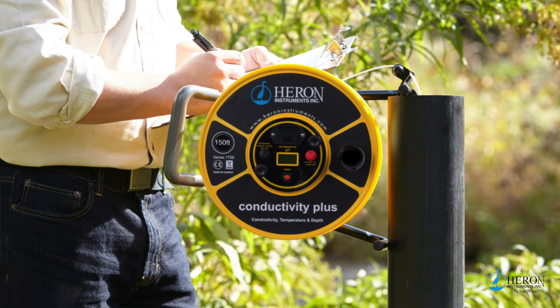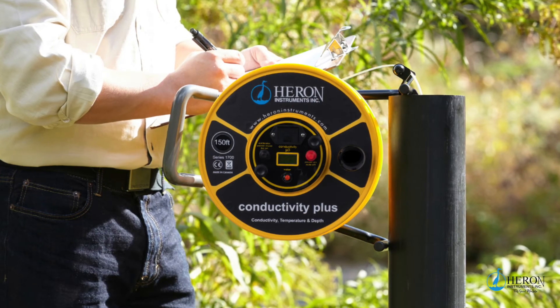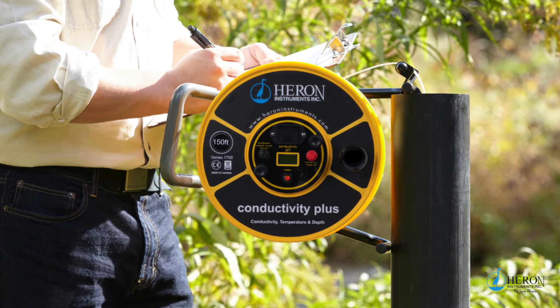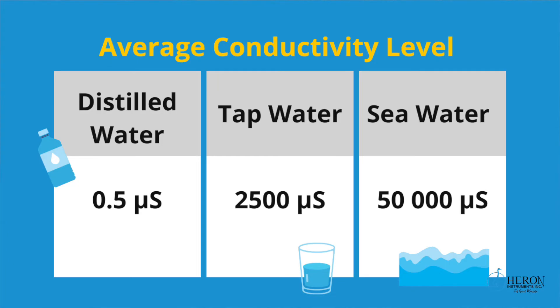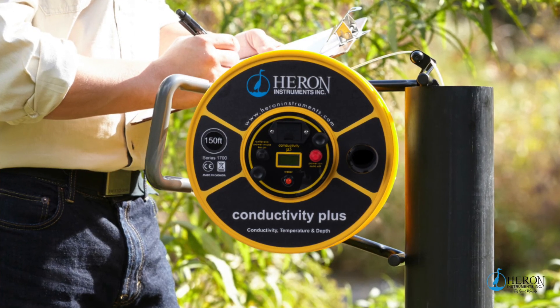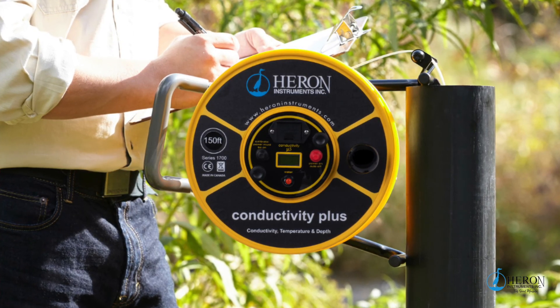After a successful calibration has been completed, the probe is ready to measure the conductivity of water. For your reference point, the average conductivity level in distilled water is 0.5 microsiemens, typical tap water is 2,500 microsiemens, and sea water is 50,000 microsiemens. The higher the reporting number, the higher the salt content; the lower would be less.